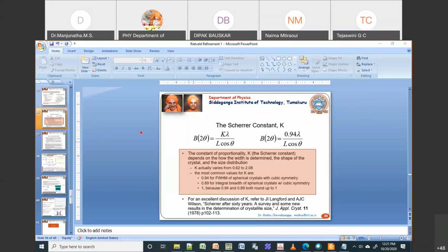Sometimes, even if I take a TiO2, I cannot have a highly crystalline anatase phase, because if I heat treat or sinter the TiO2 at a high temperature, it will change its phase to the rutile phase. So in that case I cannot take a highly crystalline sample. For that, I can use some other sample which has peaks at similar positions. Those things you can do in special cases.